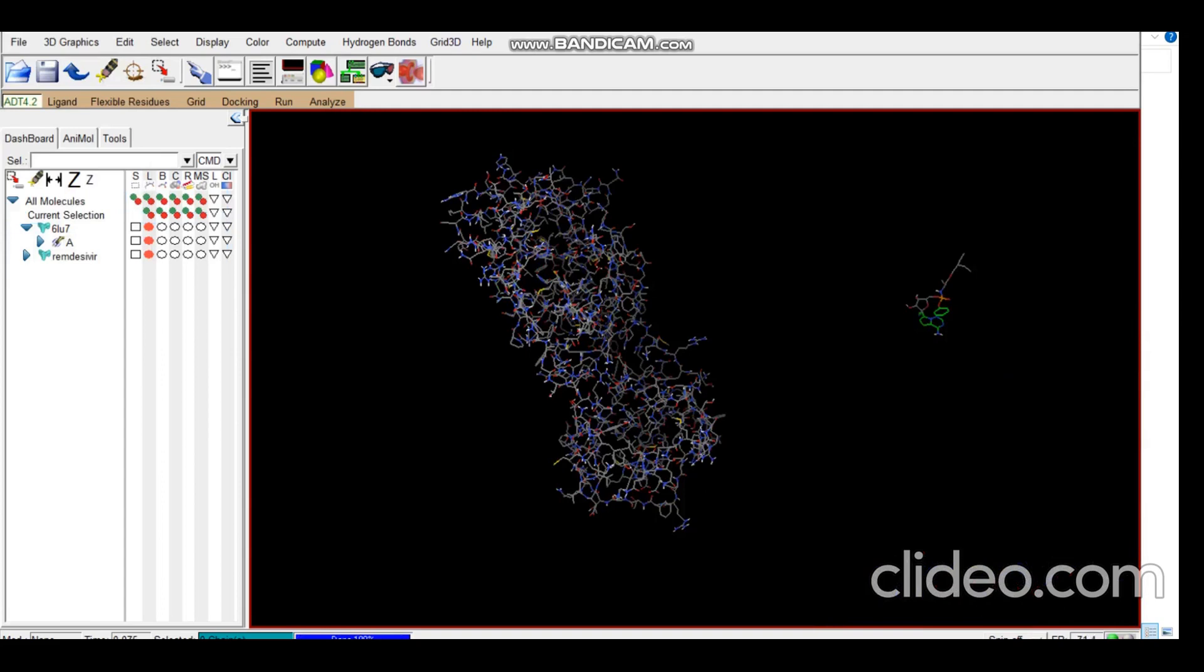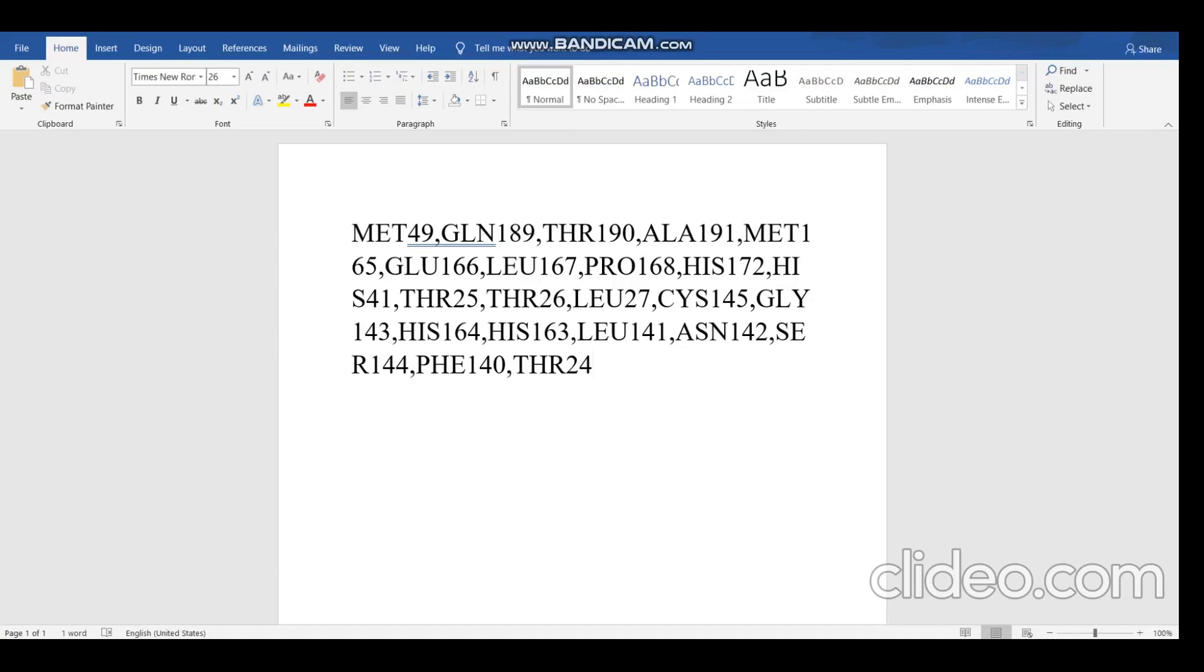So now the next step is selection of the residues. We can find these residues using CASTp or PyMOL. In this particular example I'll be using residues that I found out using PyMOL. You can note down the residues in a Word document. Always make sure that there are no spaces between any residues and every residue is separated by a comma. The name of the residues should be in capital letters only. Then you can just copy.